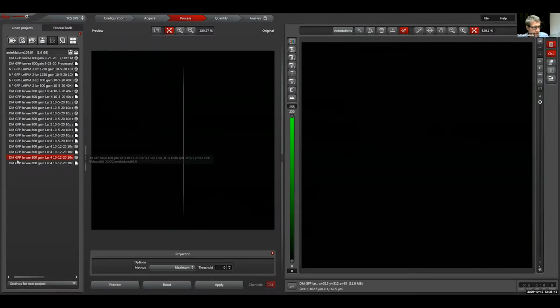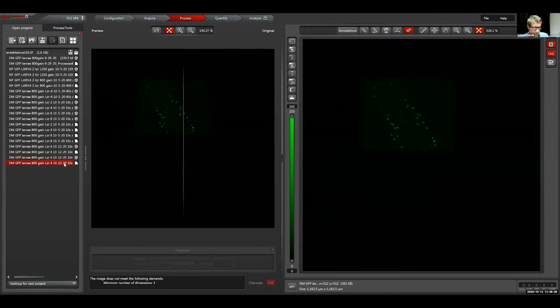Now there's a new folder here. It's the same name as your Z stack, except it added processed 001 to the end. Okay, gotcha. And if I click on that, it shows us what it is. And now it looks nice. It is only that region we were trying to find. Mm-hmm. Okay, you can actually see the square or the rectangle, right?